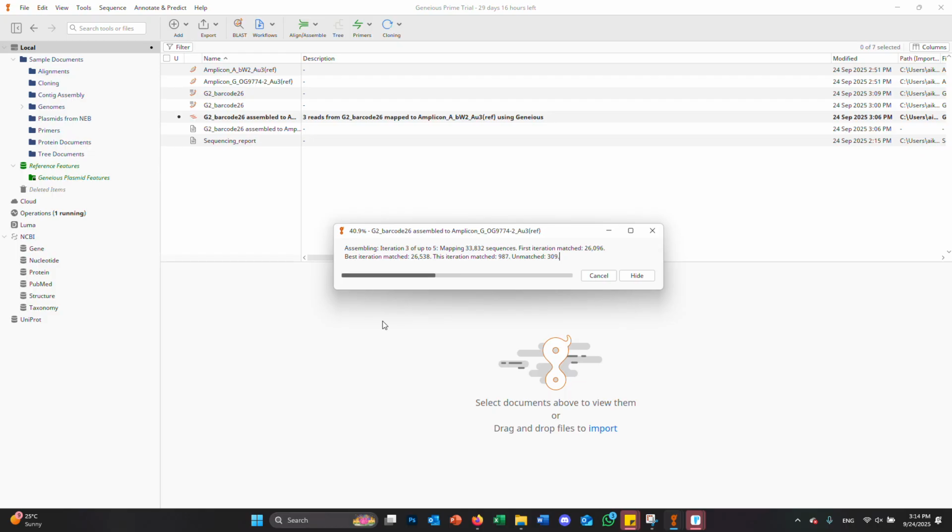The original AU one is actually in that multi-reference list, so it's going to be there anyway. And we get a multiple sequence alignment. You should have maybe 6 or more different strains in there. Some of those similarities will reduce now because you've got more sequences in the data.